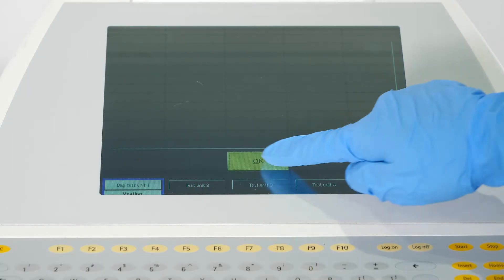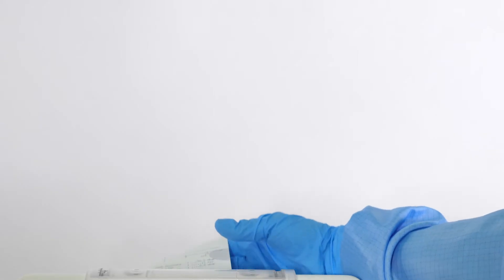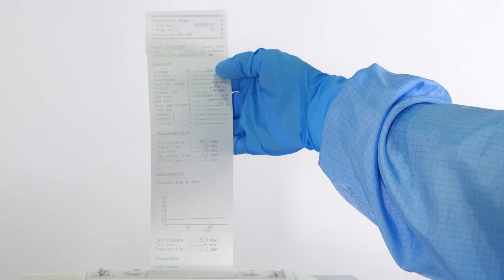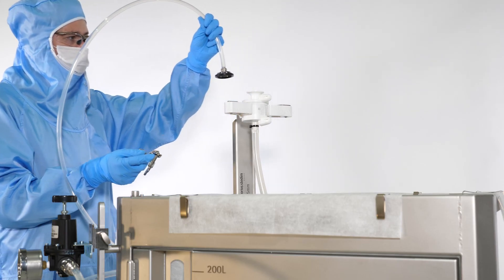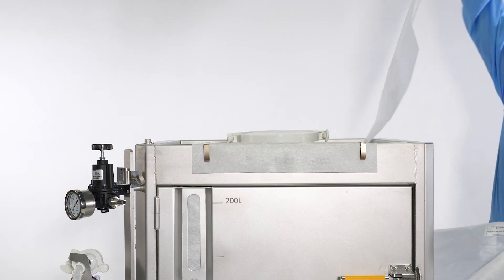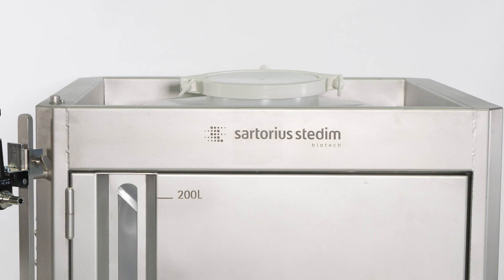Once the test is completed, the screen will display Test Passed. If required, you can print out the test results. Disconnect the filter from the testing tube. Remove and discard the side and front fleeces. The bottom fleece can remain in place.